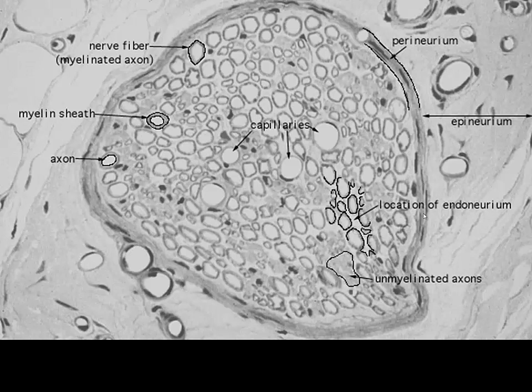Now, once again, some of these illustrate that this outer connective tissue is in fact epineurium, but where does the perineurium stop and the epineurium start? I never like to ask that unless we have several fascicles and we have the epineurium surrounding the entire nerve.